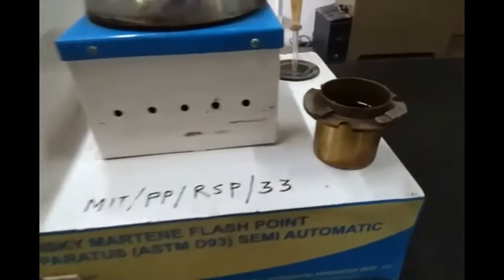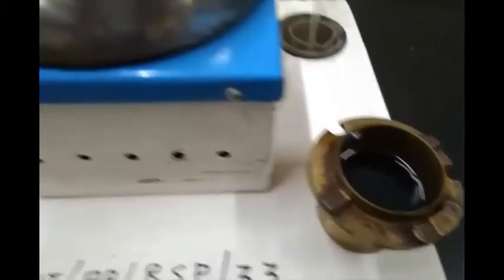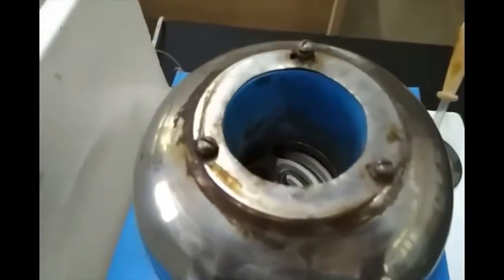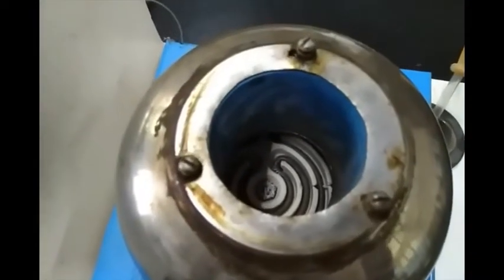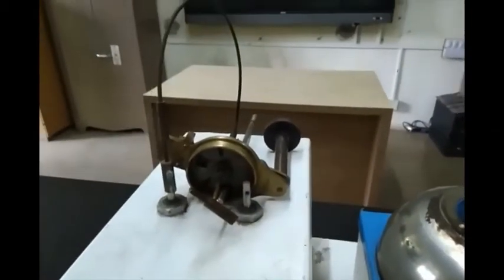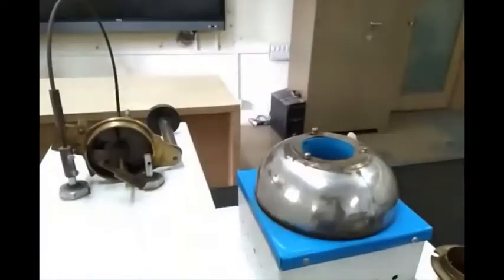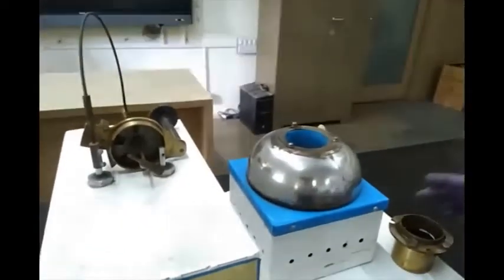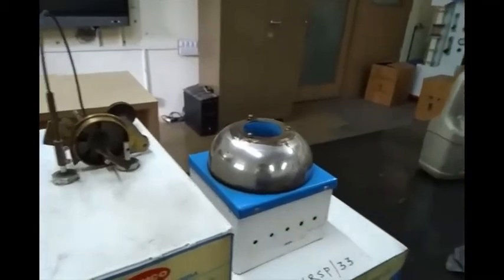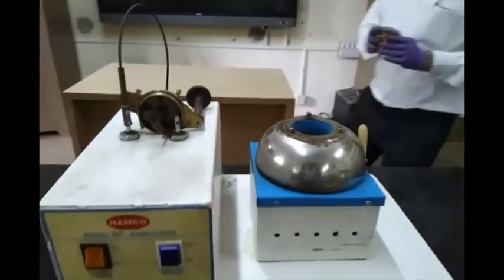Hello everyone. This is the Pensky-Martens Flashpoint Apparatus. It consists of an oil cup in which the oil is kept, a cup holder with a heater, a stirrer assembly with a thermocouple and a test lamp, and it also consists of a power regulator and temperature indicator.